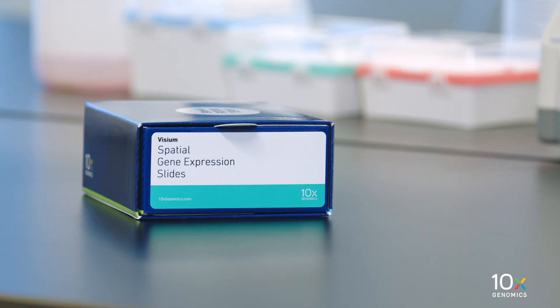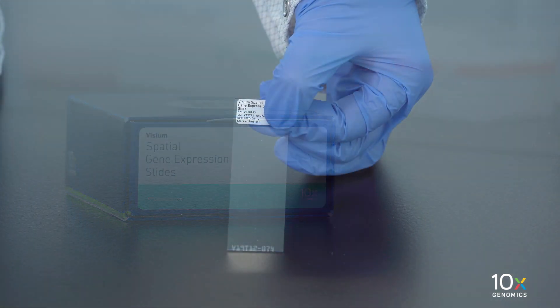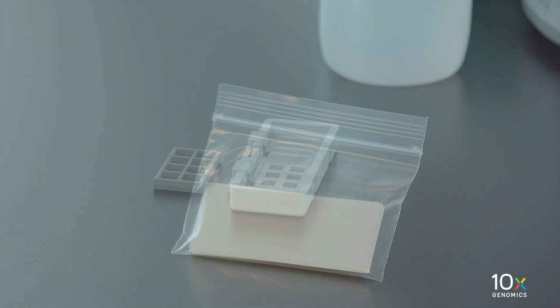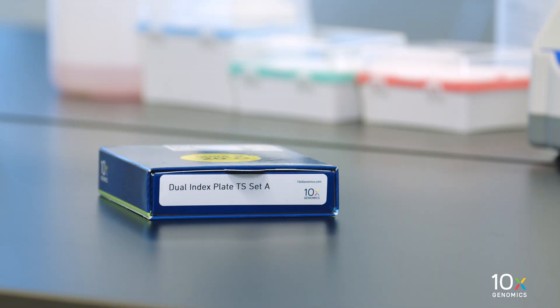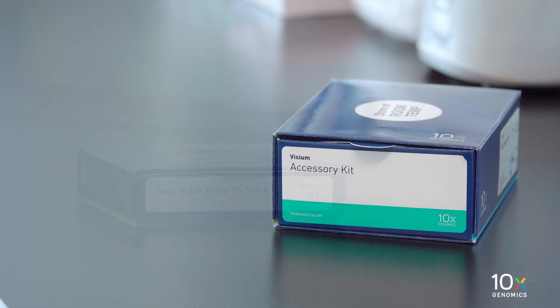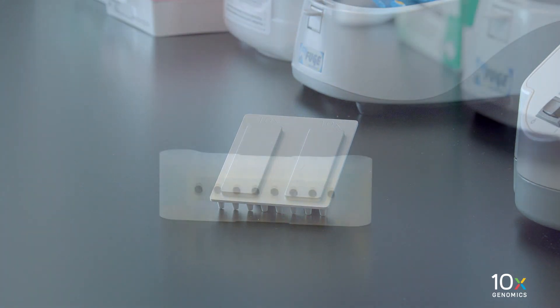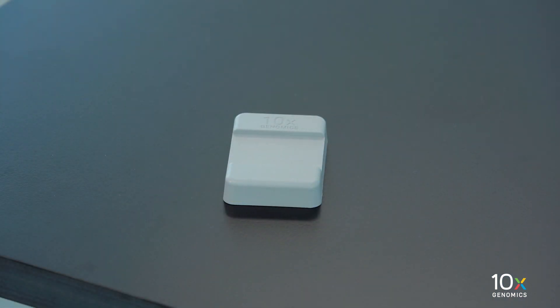The Visium Spatial Gene Expression Slide Kit is stored at ambient temperature and contains Visium Spatial Gene Expression Slides, Slide Seals, Slide Cassettes, and Gaskets. The Dual Index Kit TS Set A is stored at minus 20 degrees Celsius. The Visium Accessory Kit includes a Thermal Cycler Adapter, a 10x Magnetic Separator, and a Slide Alignment Tool.